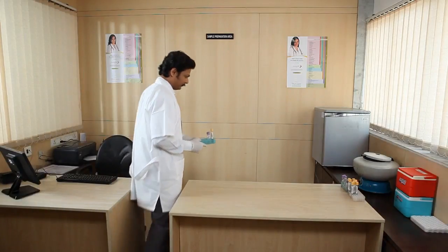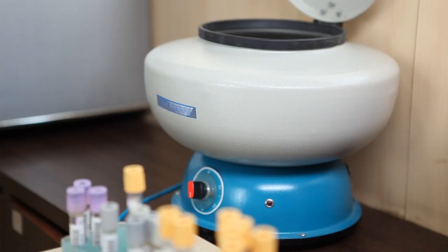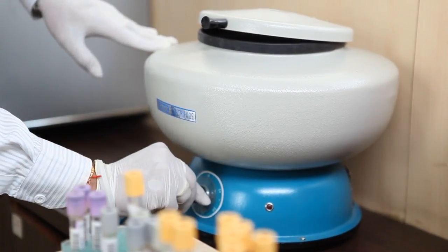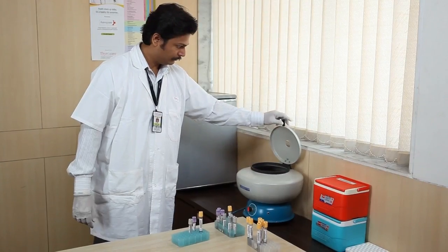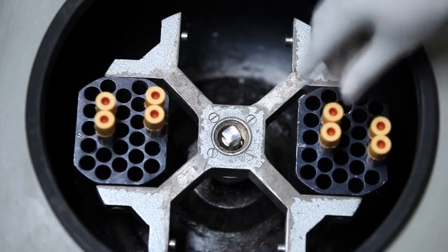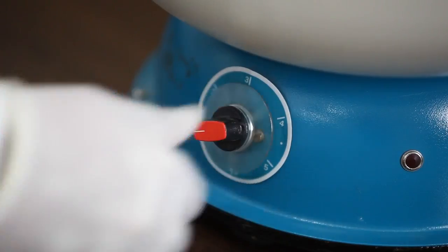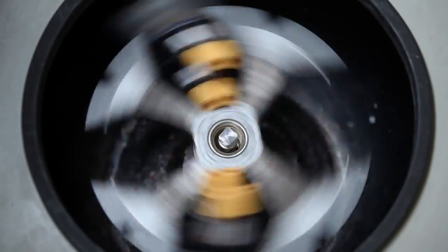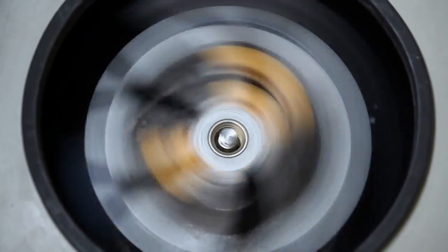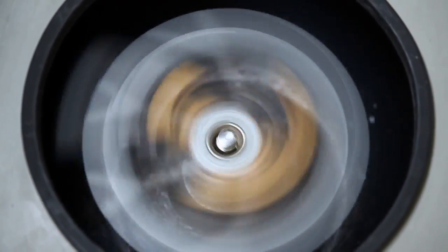Sample preparation involves separating serum from blood, for which centrifuging is required. Before placing the sample into the centrifuge, ensure the centrifuge is in stable condition, maintaining a temperature between 14 to 24 degrees Celsius. When centrifuging blood samples, the centrifuge should not be cold. The speed of rotation must be set to minimum 2000 to 2500 RPM as required for a BGT vial to be centrifuged. For serum preparation, specimens should spin for about 10 minutes.